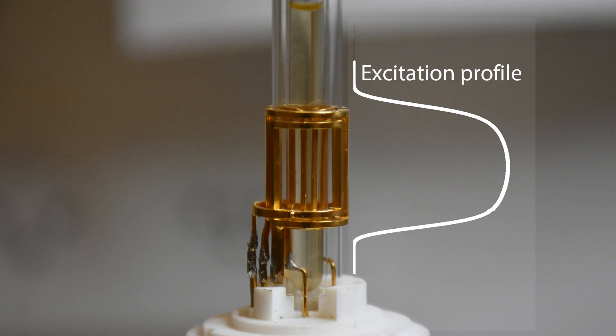The bulk magnetization shift is measured by comparing the observed shift at the vertical angle with that at the magic angle. The bulk magnetization shift depends on the bulk magnetization of the sample and its shape factor. By determining the precise shape of the sample and the shape of the excitation profile of the probe, one can use the NMR spectra to calculate the relative bulk magnetization of the sample.